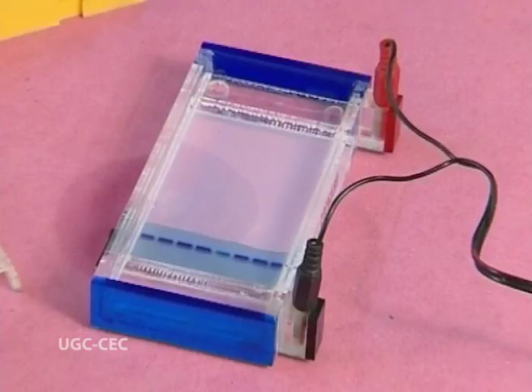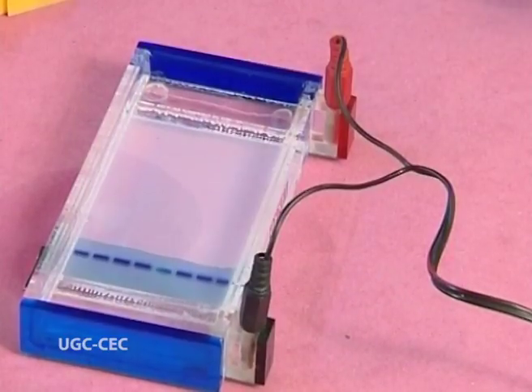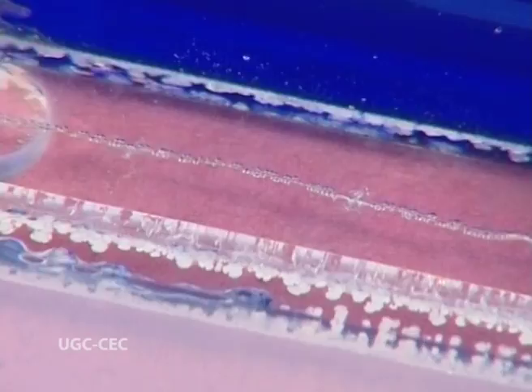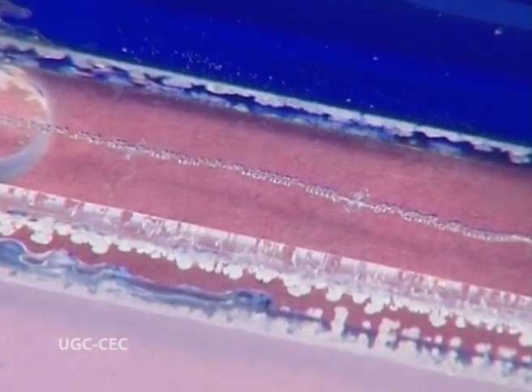The power supply has to be attached in such a way that black connects with black and red connects with red. But one thing, if the wells are placed on the opposite side by error, there is no problem. You can connect the black one with the red and the red one with the black, which will supply the current respectively. One can confirm the current passage by observing the bubbles evolving from the electrodes. Once the bubbles have started evolving, we come to know that the current is passing properly.